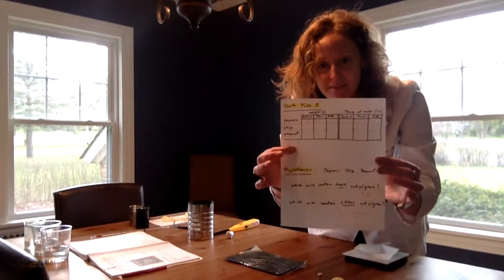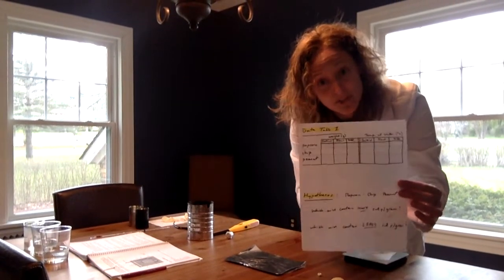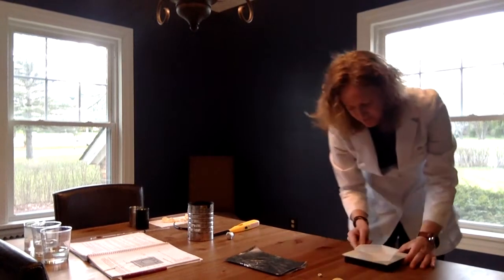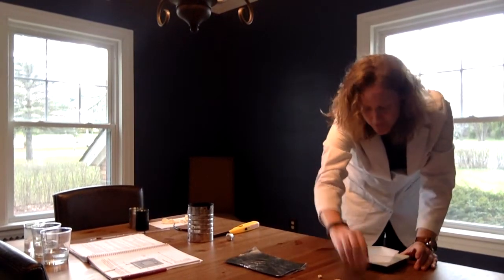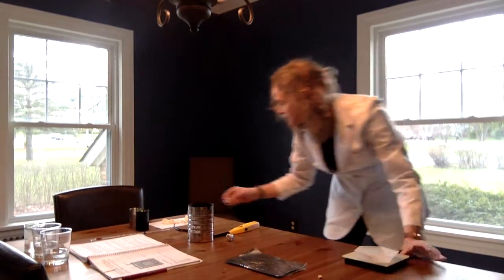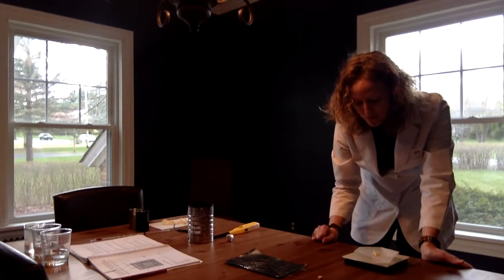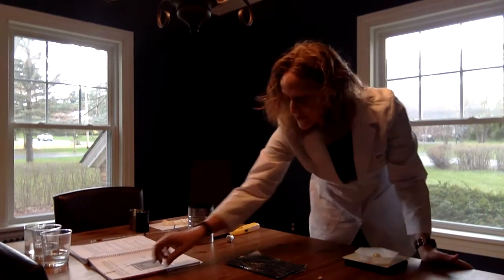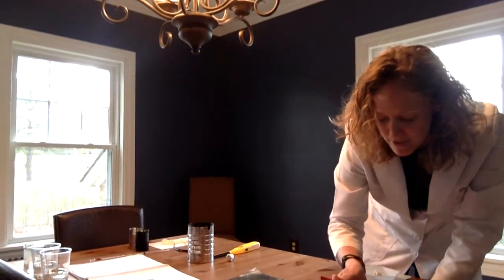I've put together the same table that's in your lab book, because from these numbers you're going to do the calculations. I put this on the scale, press zero to tare it, and put on the popcorn — 0.22 grams. So I'm going to write in the initial popcorn weight: 0.22 grams.